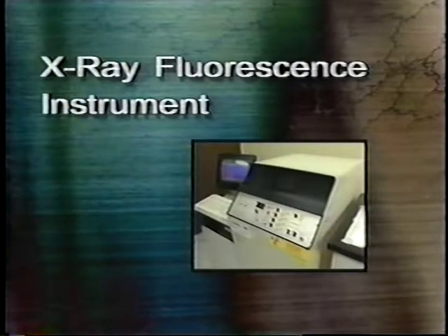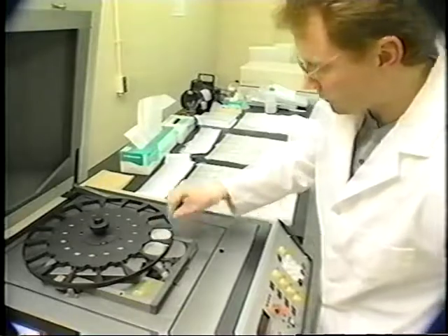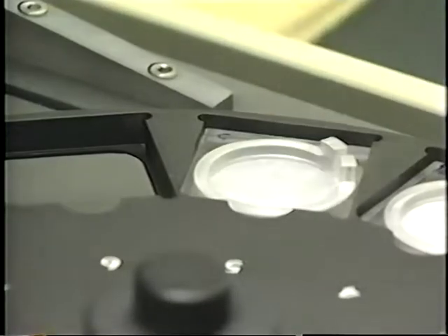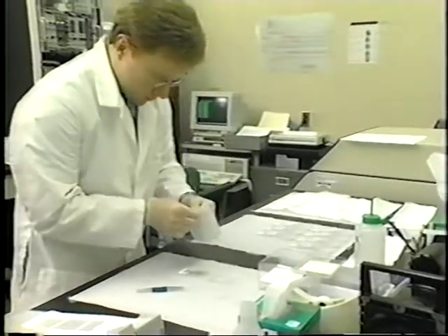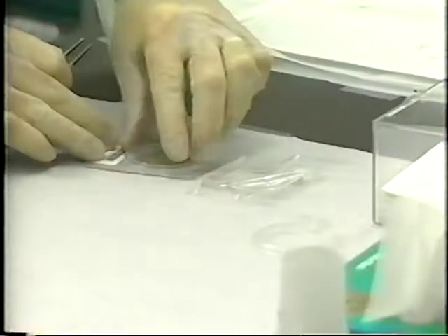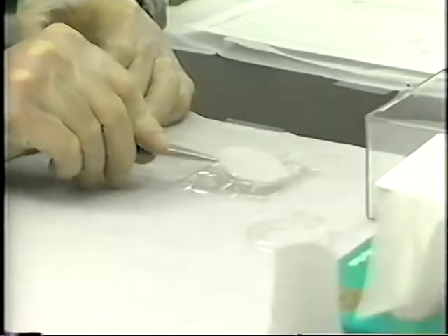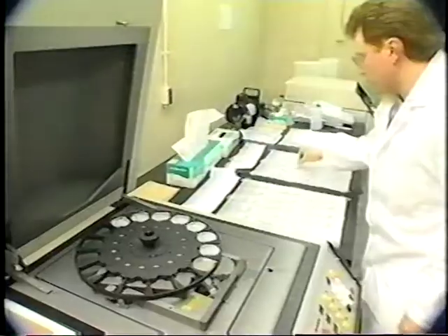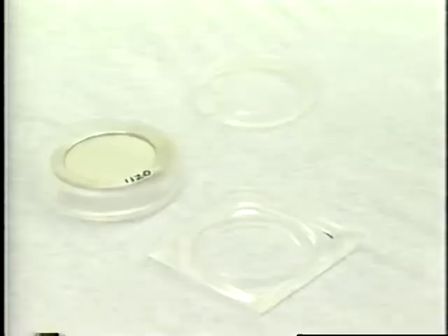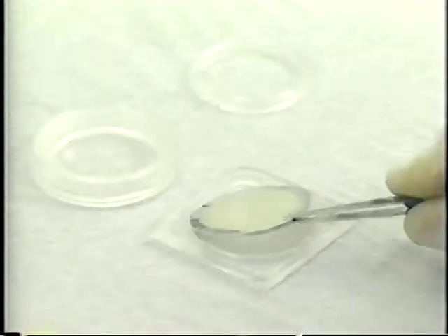First, we'll discuss X-ray fluorescence. In XRF, the filter is loaded in the cassette with the deposit side facing downward. If the filter is heavily loaded, a nylon membrane filter is first placed in the cassette, and then the heavily loaded filter is placed on top with the deposit side facing downward. A batch of 14 filters along with one replicate from a previous run and one standard are to be analyzed in each sample run of 16 filters.